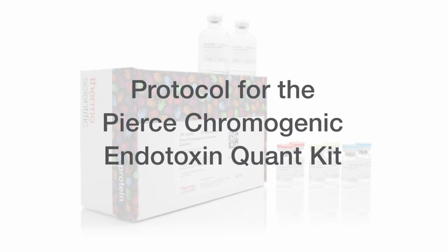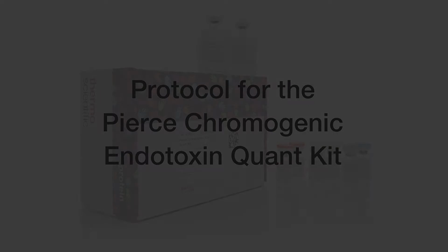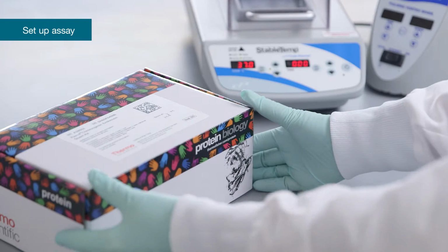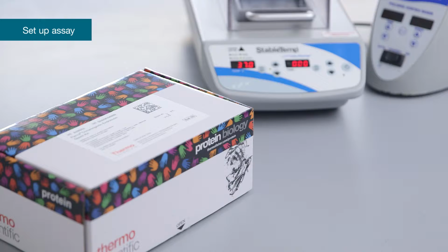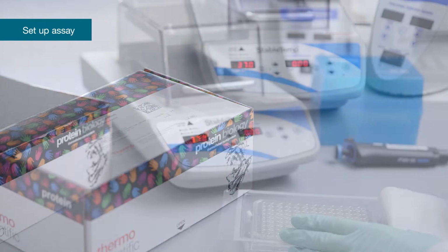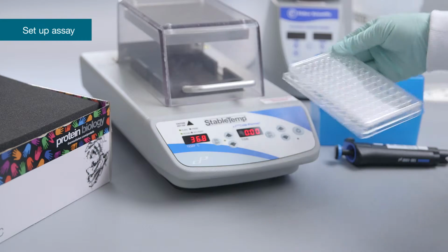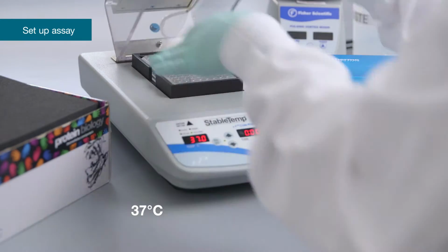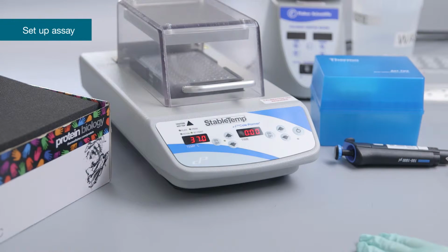Here we describe the protocol for the Pierce Chromogenic Endotoxin Quant kit. First, ensure that all required consumables, such as pipette tips, tubes, 96-well plates, and reservoirs, are pyrogen-free, and equilibrate all reagents to room temperature before use. Pre-equilibrate the plate in a heating block at 37 degrees Celsius and maintain this temperature throughout the assay procedure.